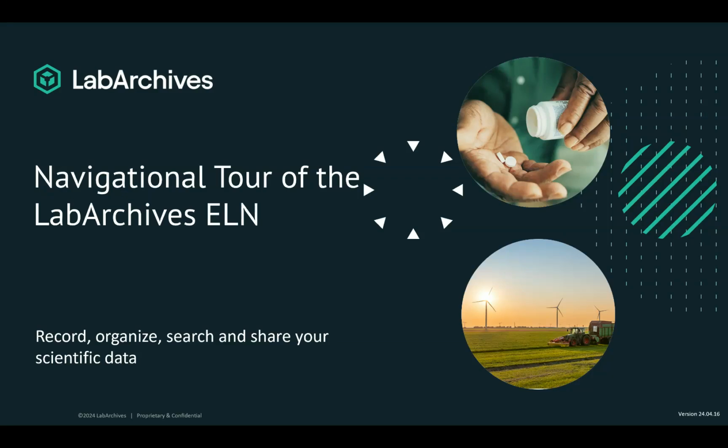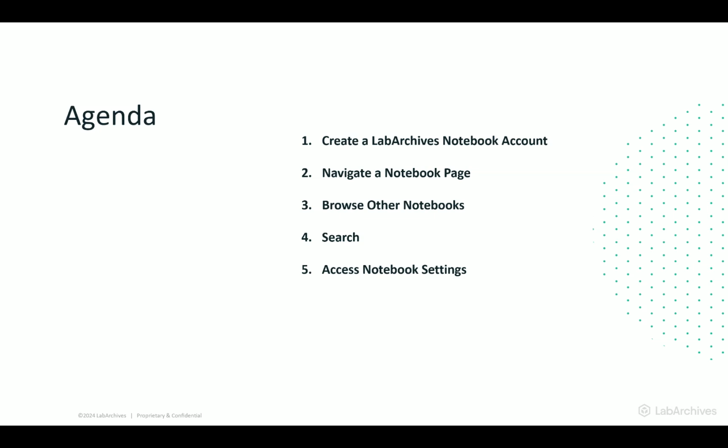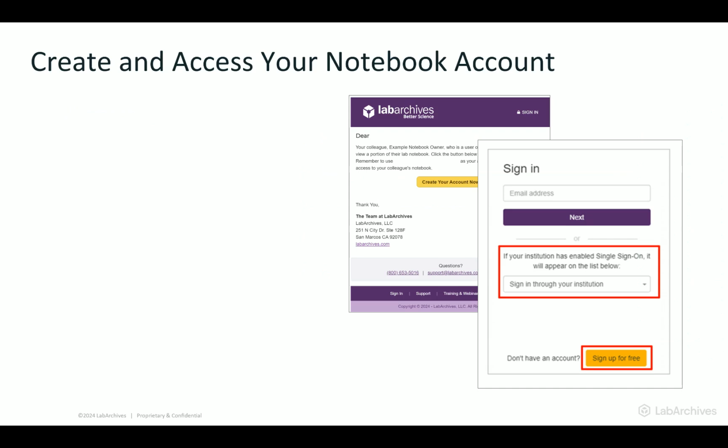During this video, we will create a LabArchives account and have a navigational tour of the notebook. We'll discuss how to create your account. We'll take a look at the first notebook that you create, discuss parts of the page. We'll browse other notebooks that we have access to, discuss search, and take a look at the various notebook settings and controls that are available.